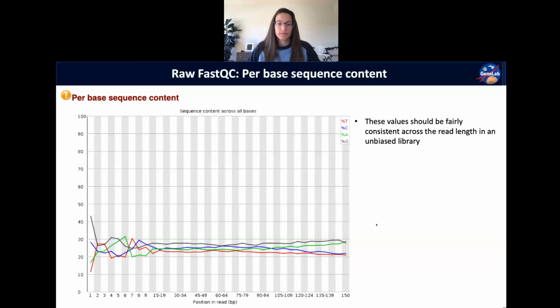Any guesses? Not favored towards anything in particular. So there's no contamination, and basically there's high diversity amongst the calls, meaning that for all the reads for each cycle, we don't have an overwhelming amount of A's being called in the same position, or an overwhelming amount of T's being called in the same position. We want to see that each call is fairly balanced, and that overall we have roughly the same level of A, T, C, and G.